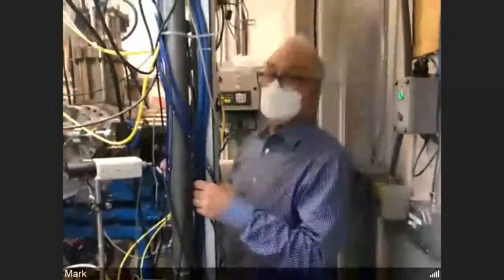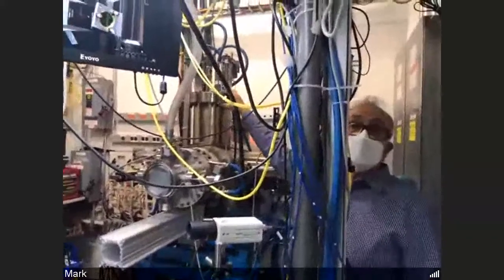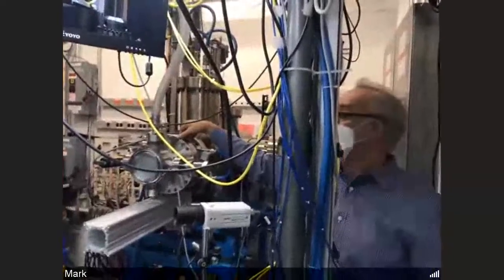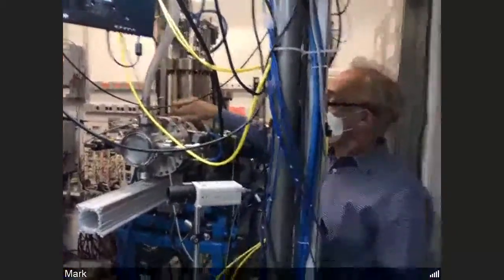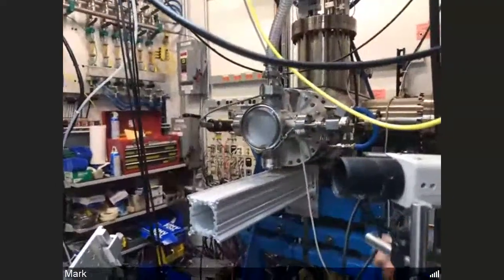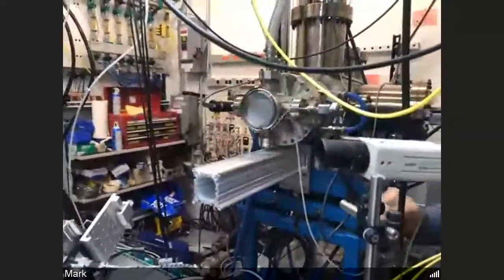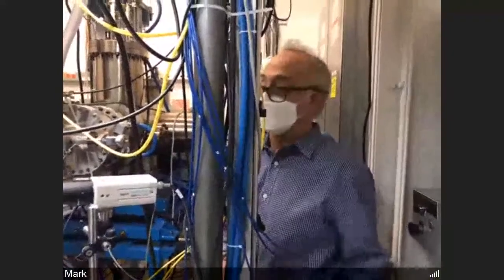And so what we see here is the end of the beam line. This is that final set of slits that I showed in my diagrams earlier. Everything from this point upstream is ultra high vacuum in the beam line. This is a beryllium window that separates the ultra high vacuum component of the beam line. We have here a roughing vacuum terminated by an aluminum window where the beam comes out. If we were in monochromatic beam, this would be a Kapton or a plastic window, and we'd have an ion chamber mounted here to measure the intensity of the monochromatic beam, and we feed back on that for stabilization purposes. But we don't need that with the pink beam.